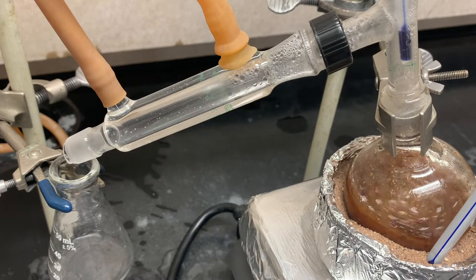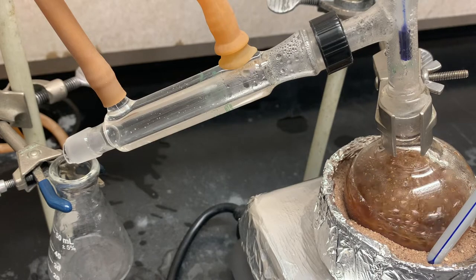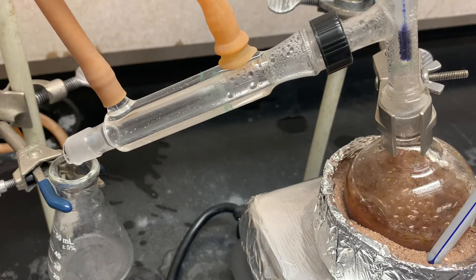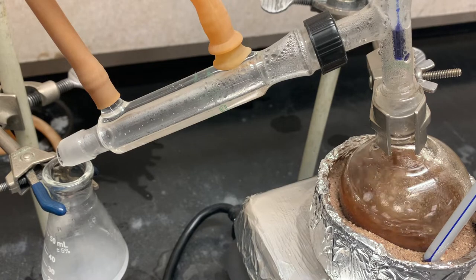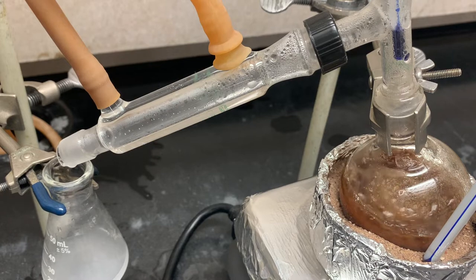Now our two solutions, the water and the eugenol, are not miscible with each other. They won't dissolve. So because of that, if you look closely, you can see that they are in fact cloudy. Okay, let me zoom in on that. Now after some time, you're going to distill enough of this over that the bubbles are going to start to stack up. You just want to make sure you stop this before those brown bubbles make it over, because they have a lot of other things in it which we don't want.